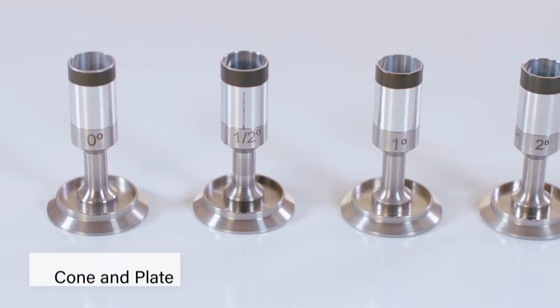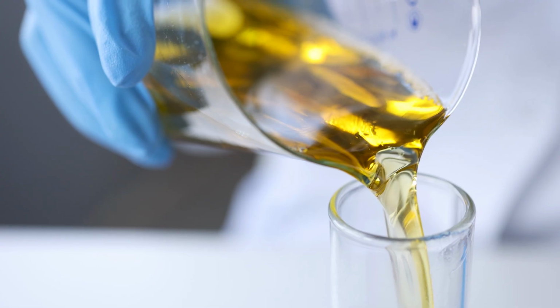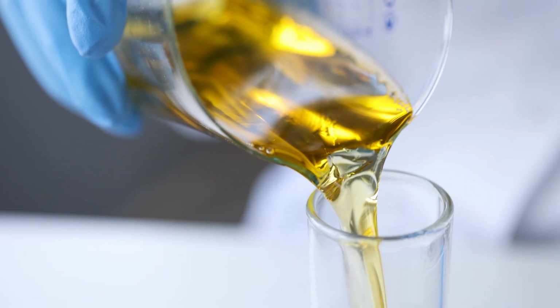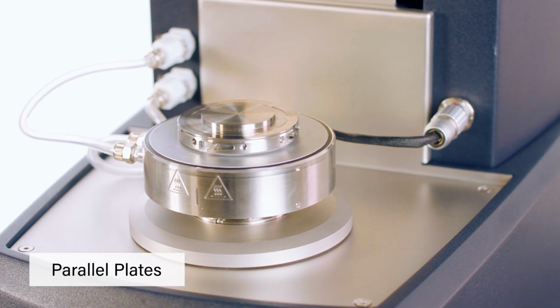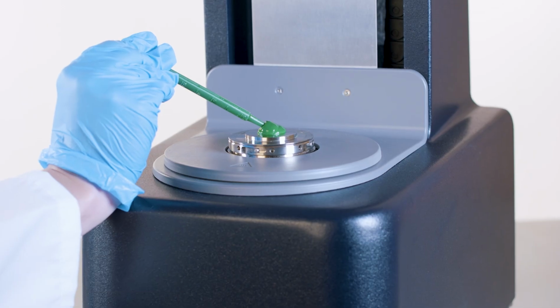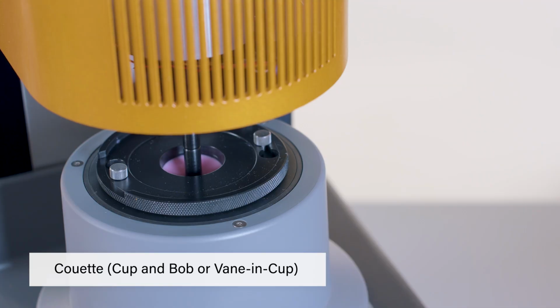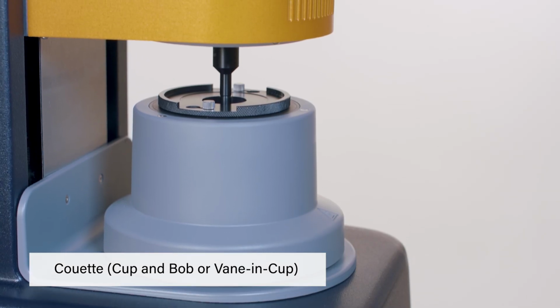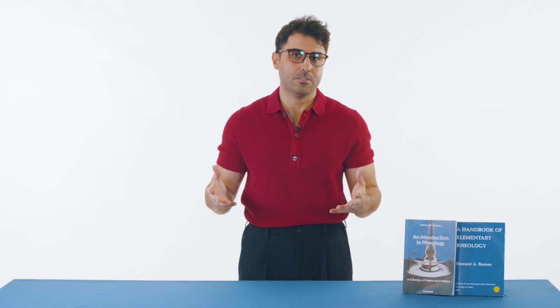Depending on the material and the design task, we choose different geometries. Cone and plate, great for low viscosity fluids like oil. It gives a uniform shear rate and it is very precise. Parallel plate, good for soft solids or samples with particles. It is easy to load and trim. And Couette, cup and bob or vane in cup, ideal for low to medium viscosity fluids. It helps reduce evaporation.